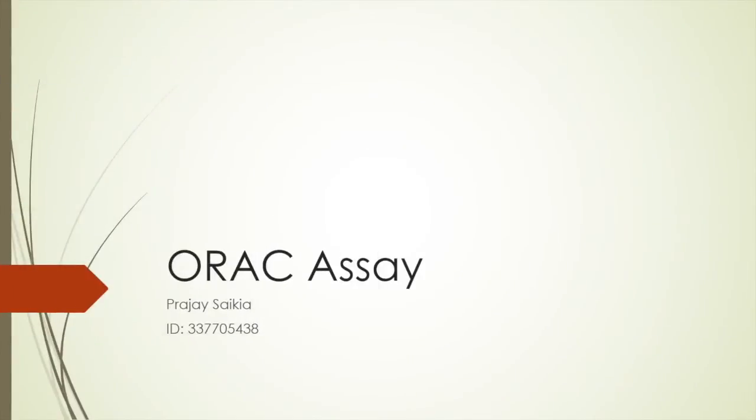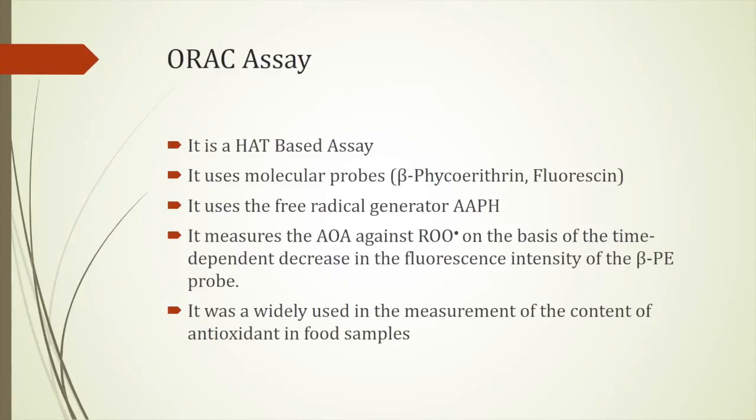Now we look into the ORAC assay. It is a hydrogen atom transfer, or HAT-based assay, which uses molecular probes to measure the antioxidant activity of samples. It measures the antioxidant activity against free radicals on the basis of time-dependent decrease in the fluorescence intensity of the probe. The probes most widely used are beta-phycoerythrin and fluorescein.